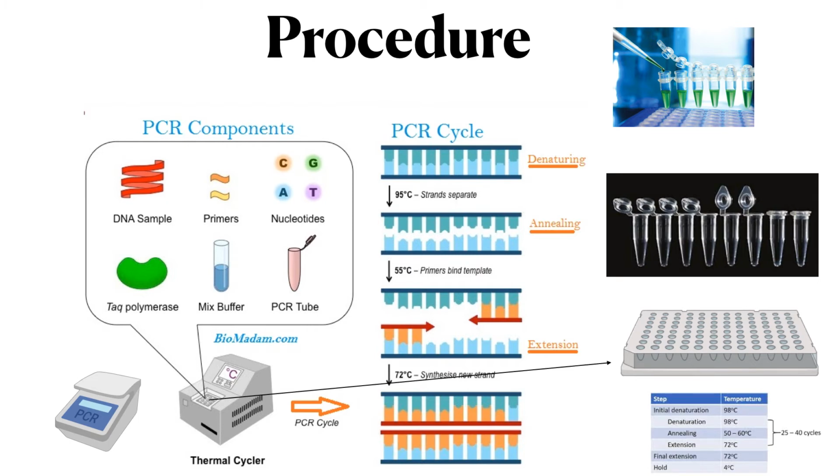From the whole length of DNA, only a certain length can be amplified, and the length of DNA can be measured in base pairs. So first we have to identify that length of DNA to be amplified from the whole circular DNA or whole genomic DNA. Then we have to identify the forward and reverse primers for that section of the DNA. Then we have to add nucleotide bases because the DNA sequence is a nucleotide base sequence.